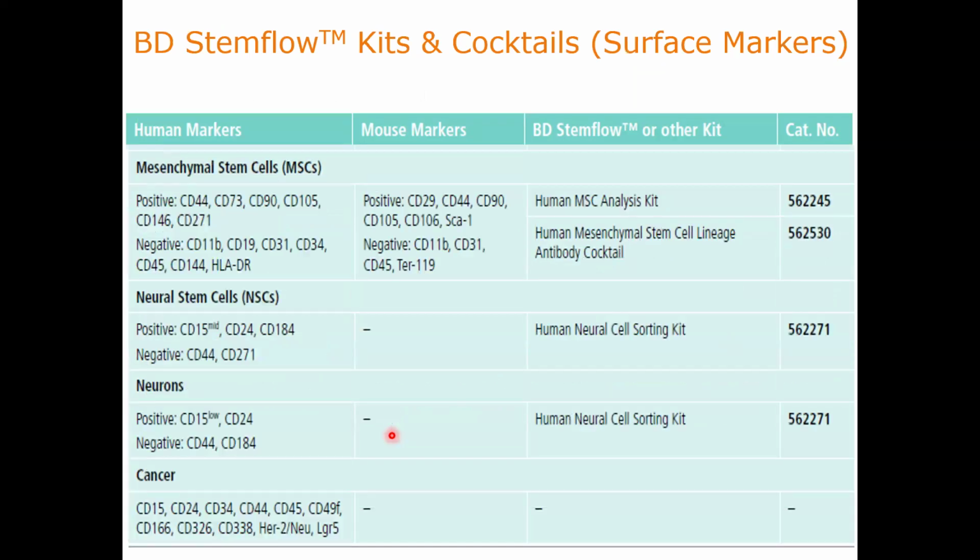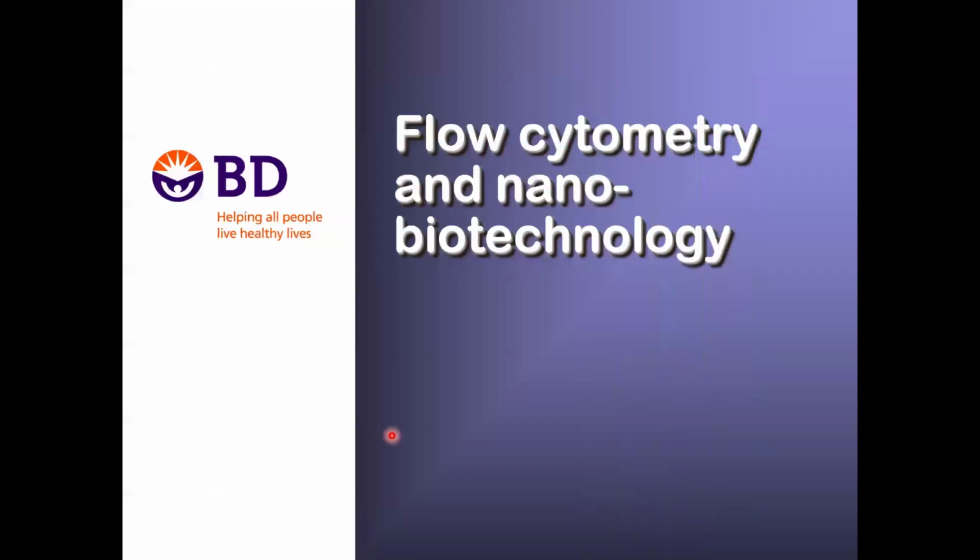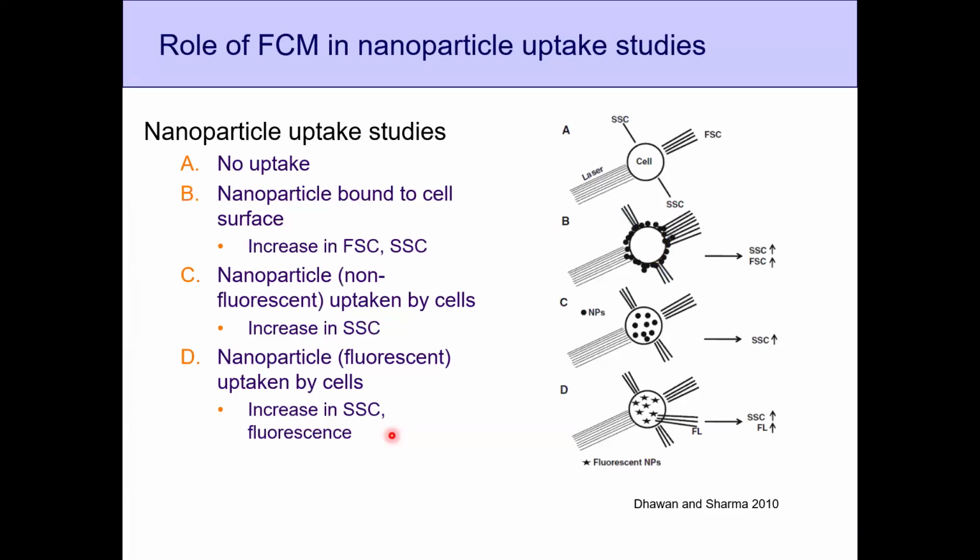Then these are the stem cell flow kit. Now let's talk about flow cytometer and nanobiotechnology. As I told you, you can use flow cytometer in nanobiotech also. Many people are doing that already, and how it will be helpful.